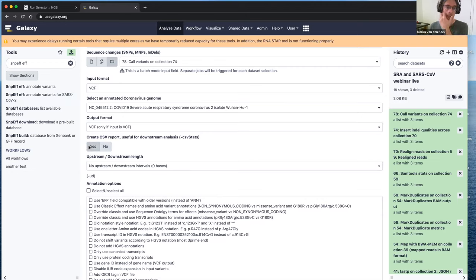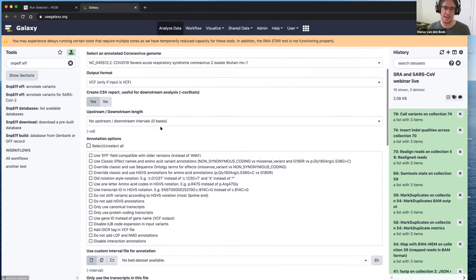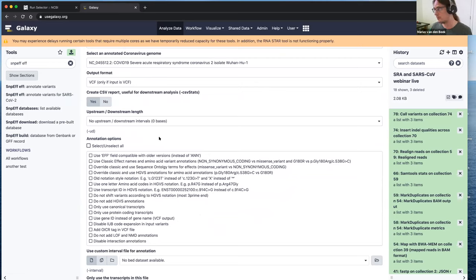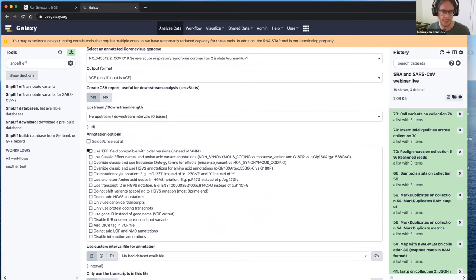The next step is SnpEff, a tool that looks at variants and predicts what effect they actually have. There's a special version just for SARS-CoV-2 that handles the multiple overlapping reading frames in the SARS-CoV-2 genome. As input we select the VCF file we just generated, create a VCF output, and also create a CSV output that we'll use later to generate a summary report. We won't include upstream or downstream intervals, as those are more appropriate for genomic variants from non-viral sequences.